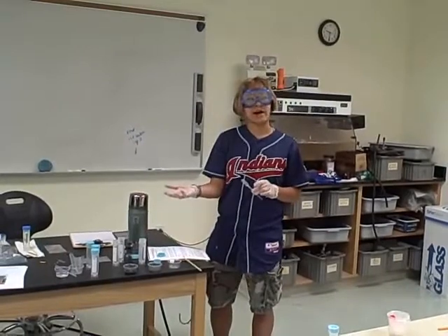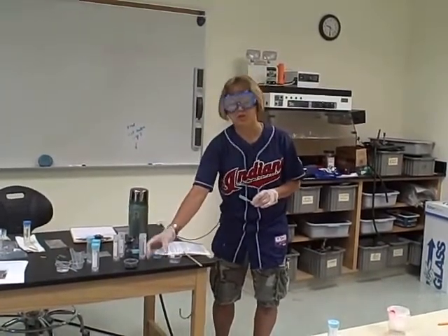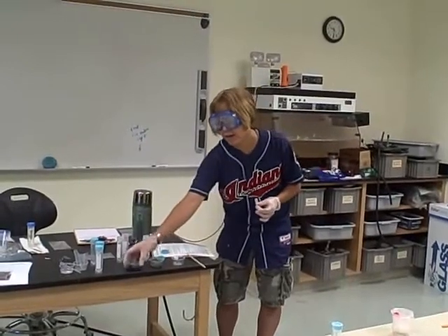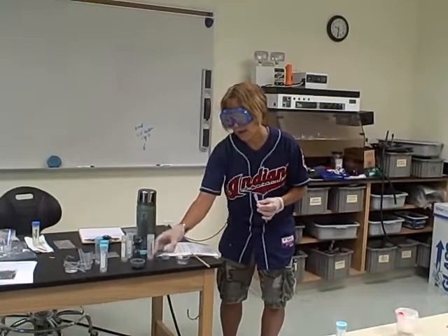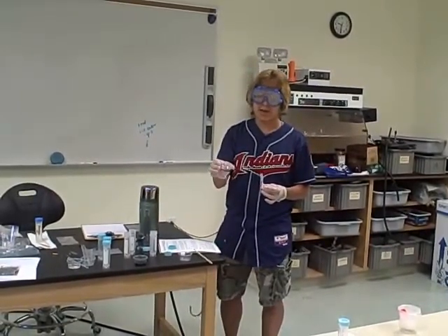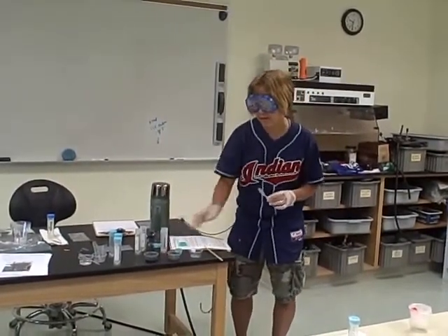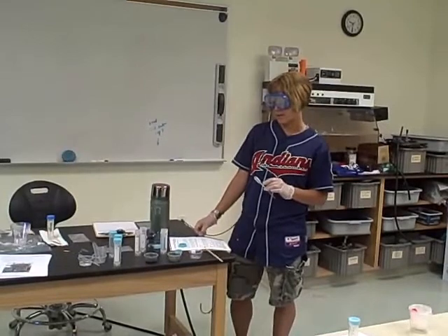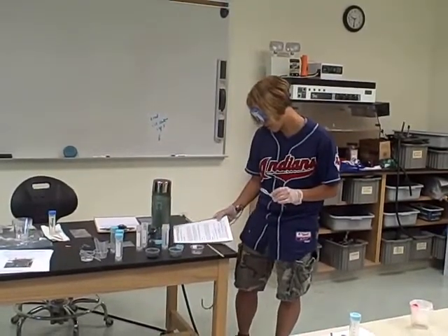As the material reoxidizes back to the +2 states, you should start to see it go back to more of an orange color for the cobalt, and the copper may end up going back blue. You'll just have to see what happens. And this also depends on how much sodium borohydride that you added. I think that covers most of it.